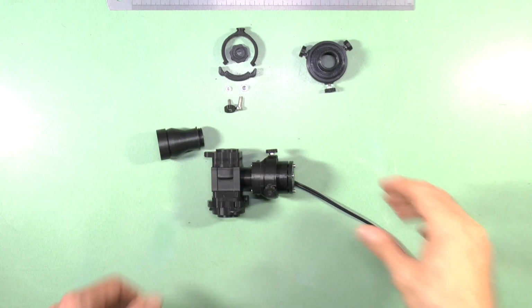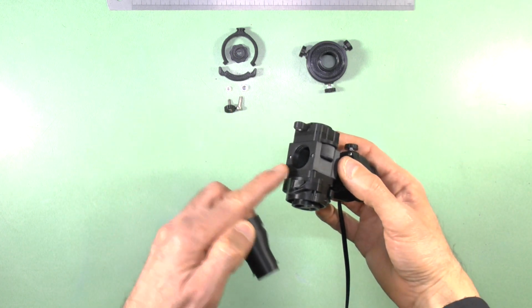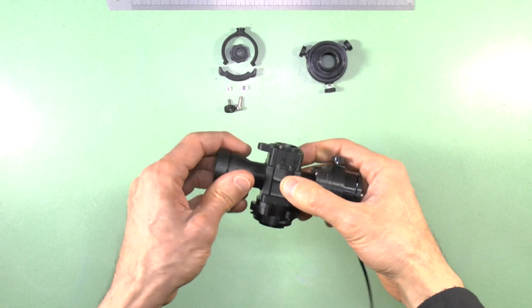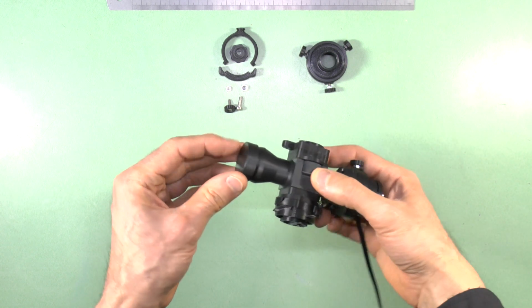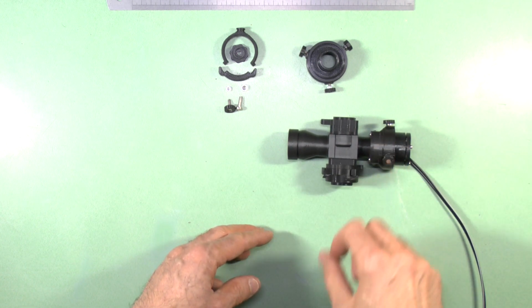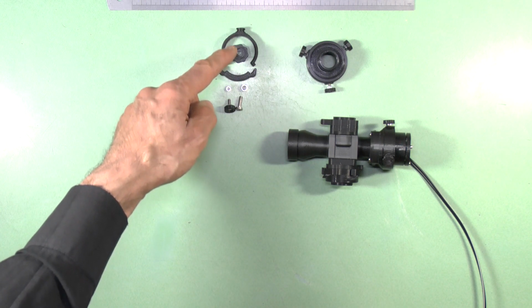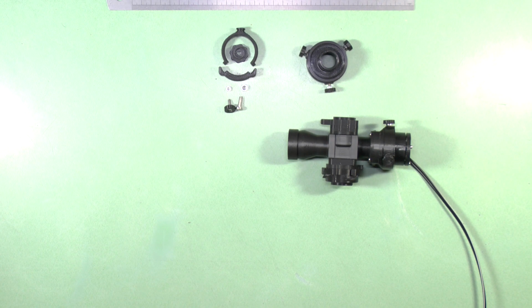If not using the augmented reality projector, you screw the Epi-black body into the other side of the filter block. This expanded portion of the Epi black body allows you to get greater stability and to compensate for any uneven stress placed on the optical tube by the weight of the Epi-illuminator by fixing it in place with the AR clip, clip lock and stay mechanism, which is also used to support the augmented reality projector.